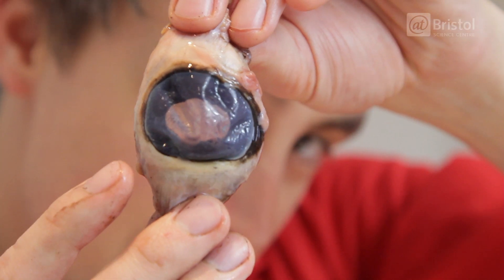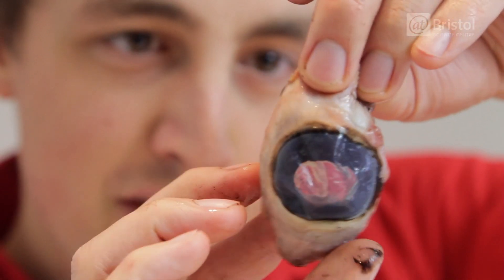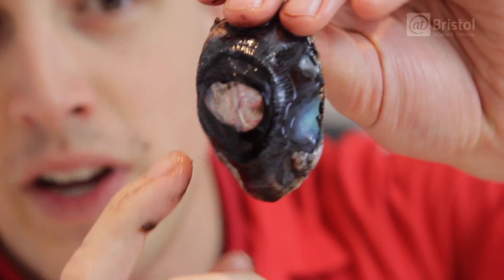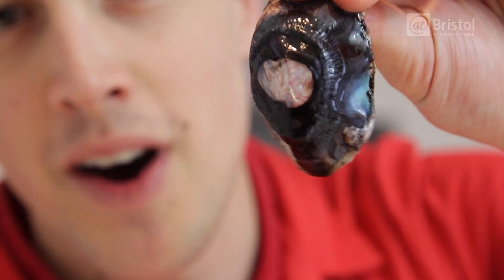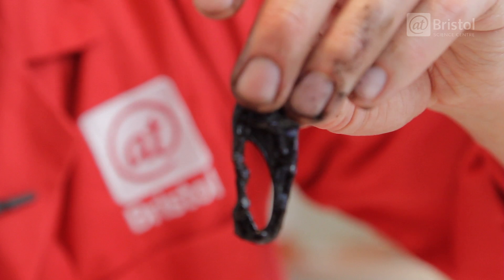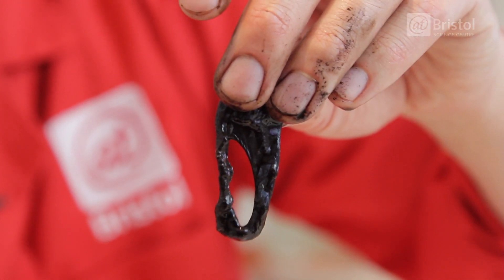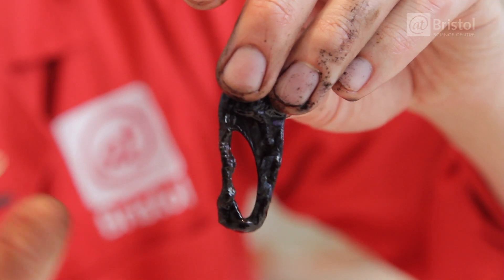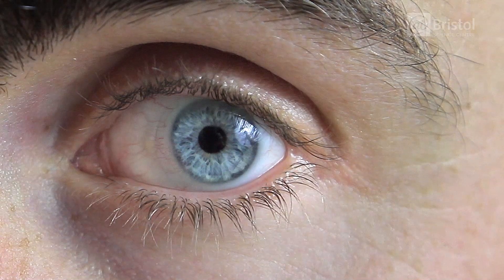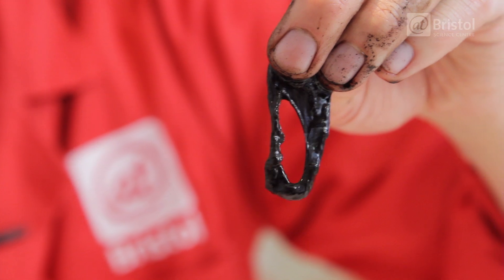Here we have the front of the eye, and once again you can see the cornea just here. But if we turn this around, on the inside we can now see the colored part of the eye called the iris. So the iris is a muscle which controls how much light enters the eye. So if you're around lots of light, then it will close down, making the hole here called the pupil very small. But if you're in dark conditions, then it will open back up, meaning more light can enter.